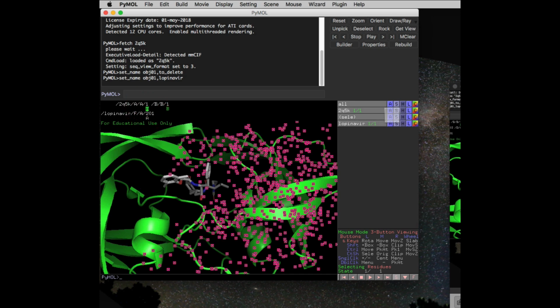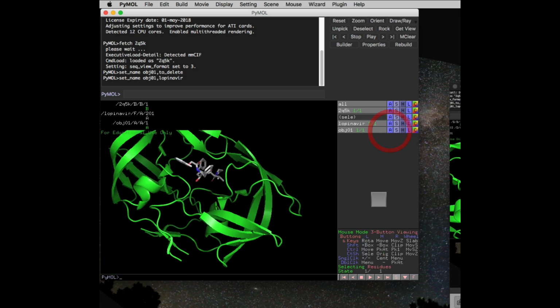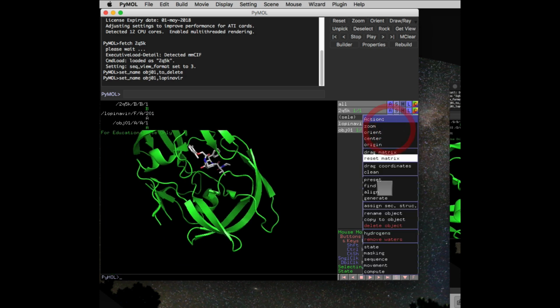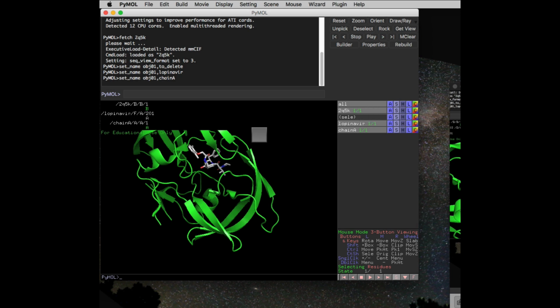And now we can see too that we have two subunits, which I'll extract. The A subunit, let's rename that now. Chain A. And what remains, since I extracted it in the original object, is chain B, which you can see if you click. You'll see all the atoms selected if you click it.